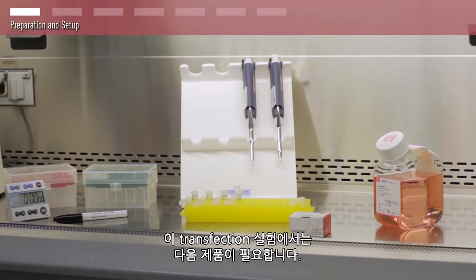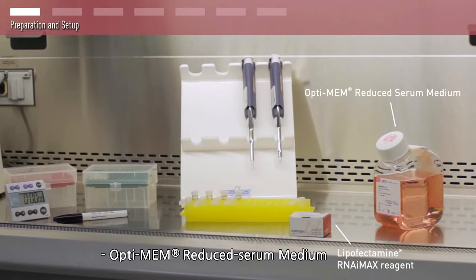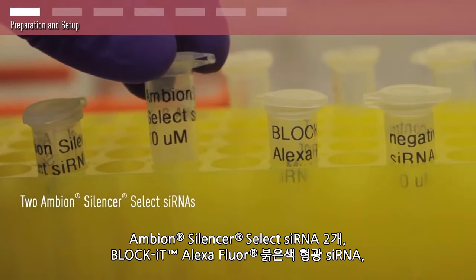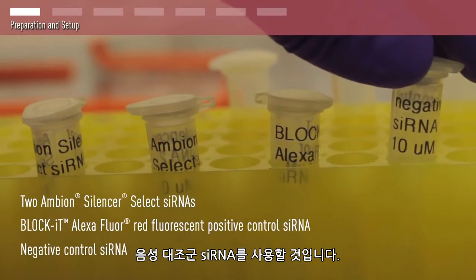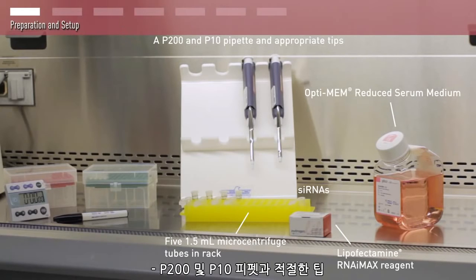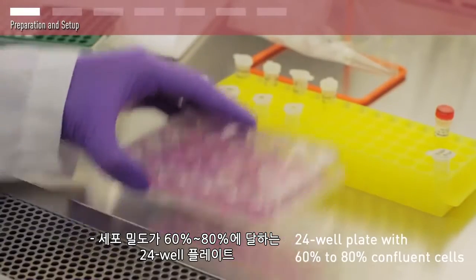For this transfection experiment, you will need Lipofectamine RNA IMAX reagent, Optimem reduced serum medium, and siRNAs diluted to a working concentration of 10 micromolar. We will be using two Ambion Silencer Select siRNAs: a Block-iT Alexa Fluor red fluorescent siRNA and a negative control siRNA, five 1.5 milliliter microcentrifuge tubes in a rack, a p200 and p10 pipette and appropriate tips, a marker and a timer, and a 24 well plate with 60% to 80% confluent cells.